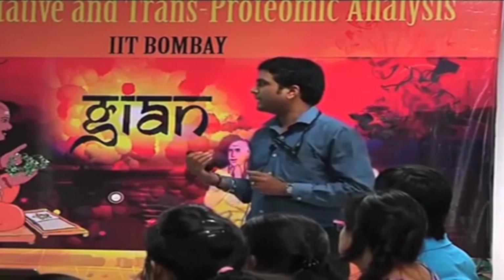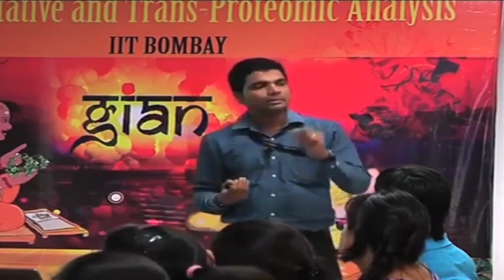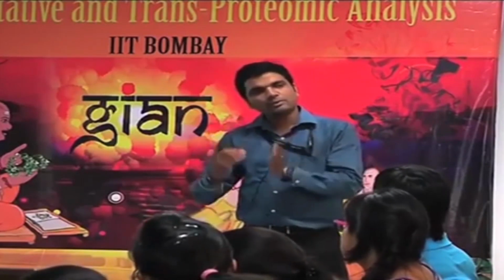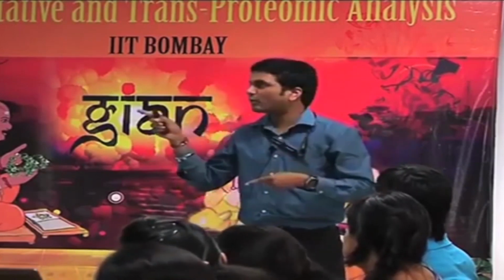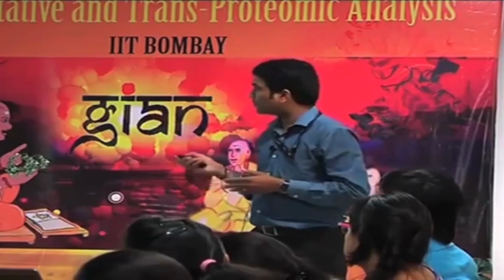When you do the analysis of your compound of interest, for example, I want to analyze a compound having a molecular weight of 390. For 390, the DC to RF voltage information is already stored, so the quadrupole maintains that voltage. Only that ion gets selected in the quadrupole; the rest of the ions get destabilized and go to the vacuum.